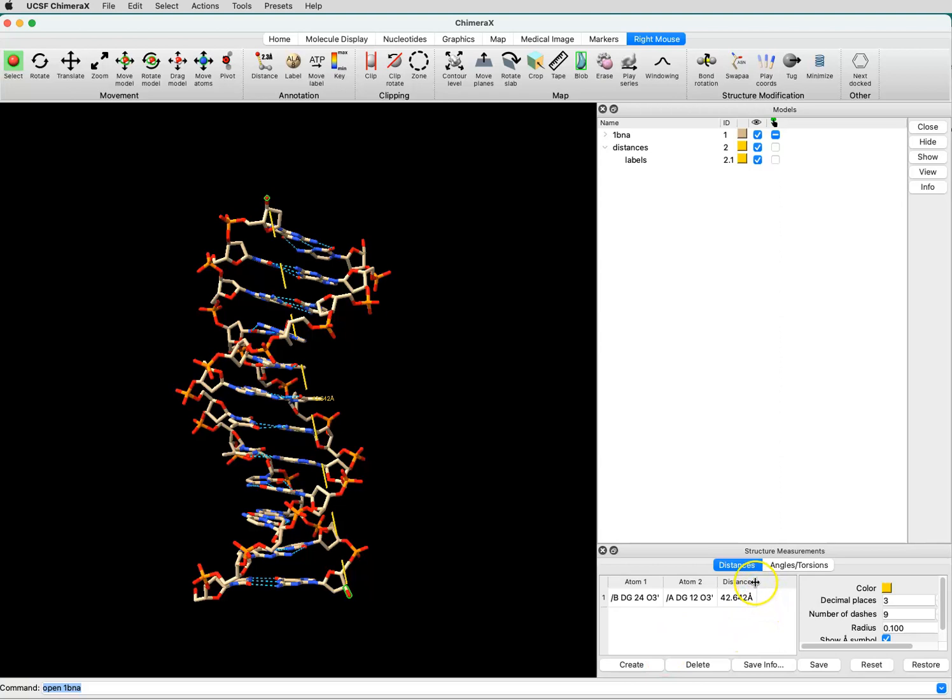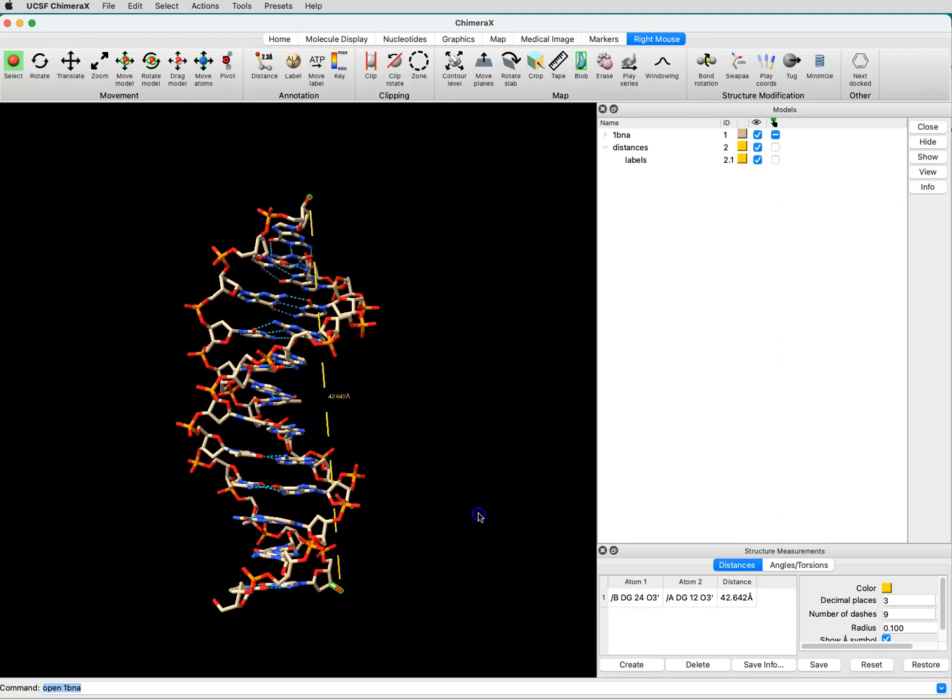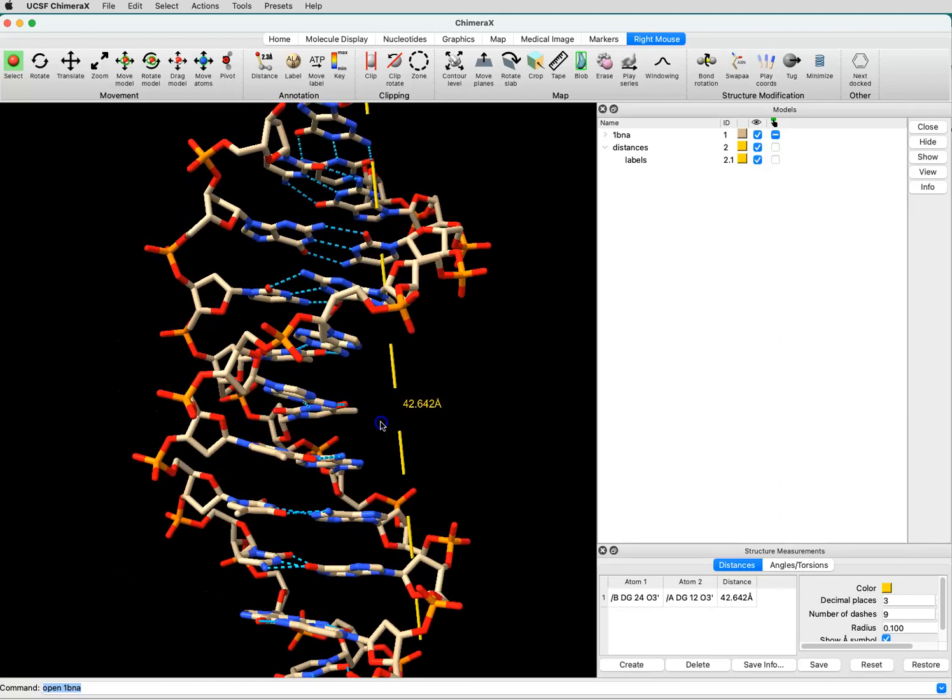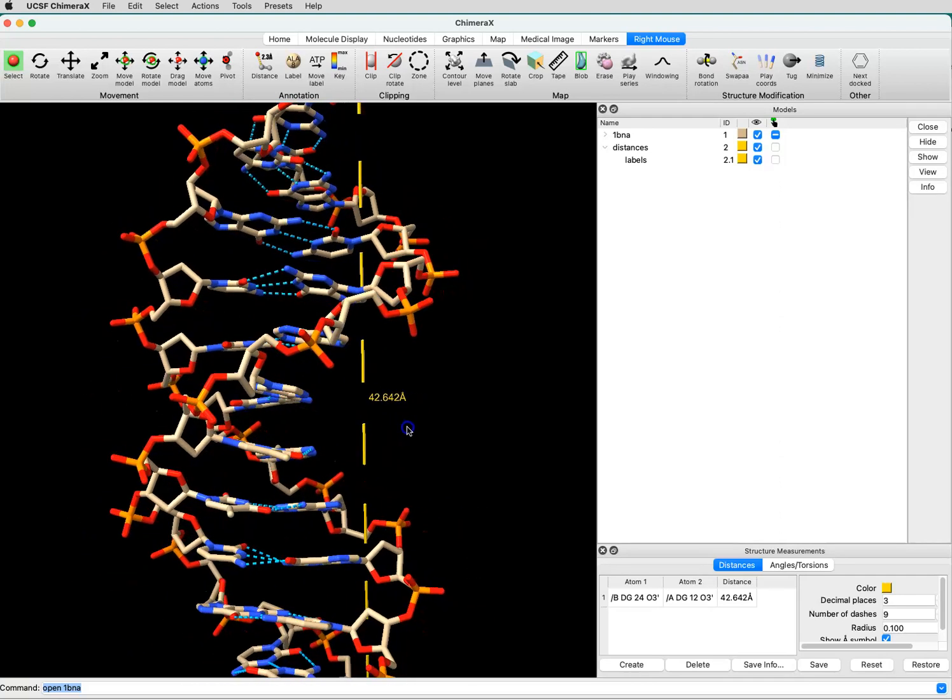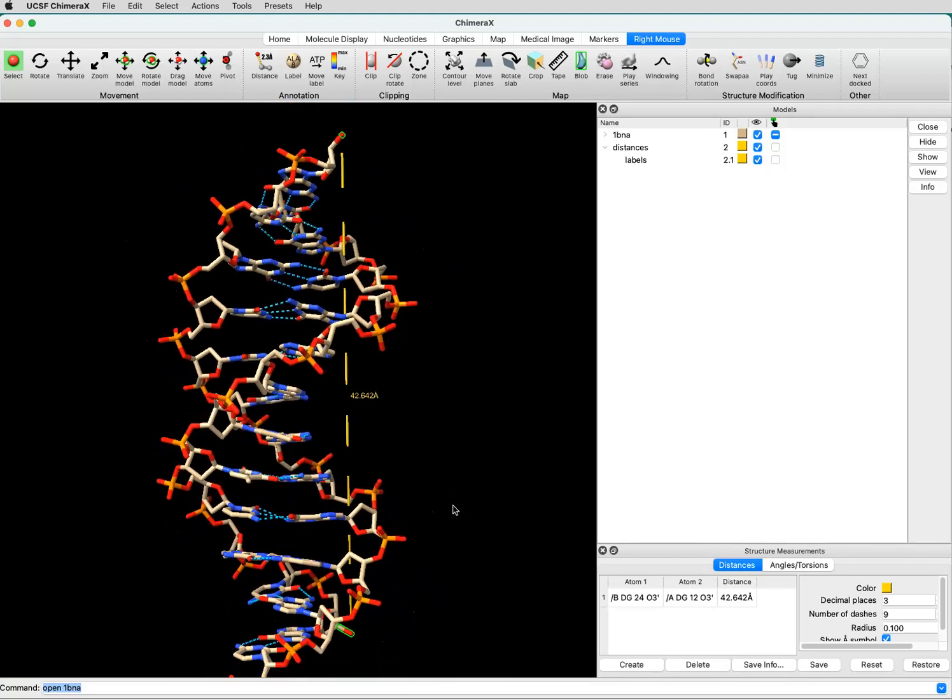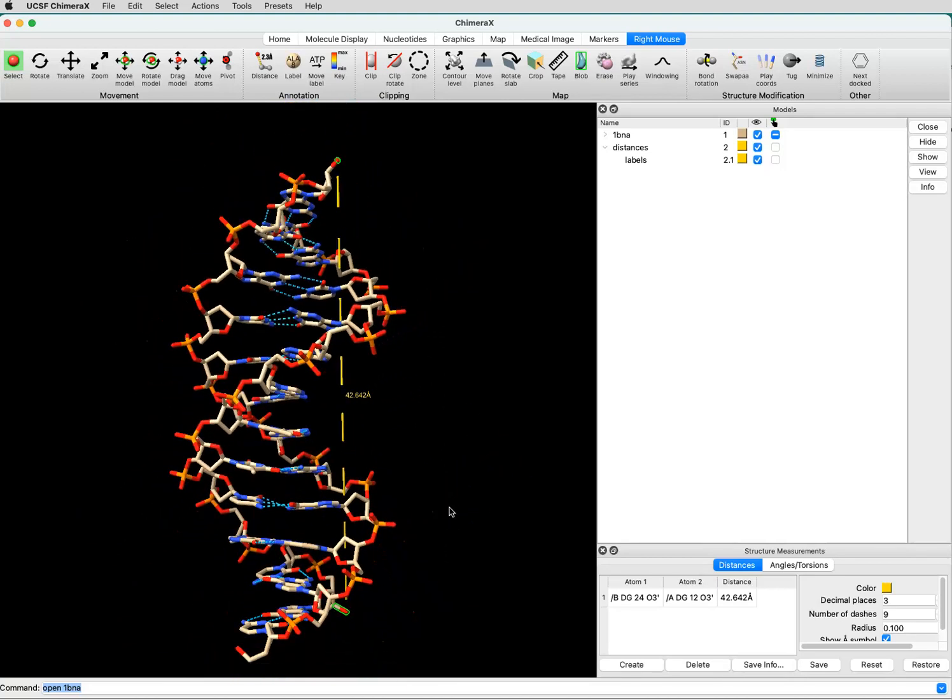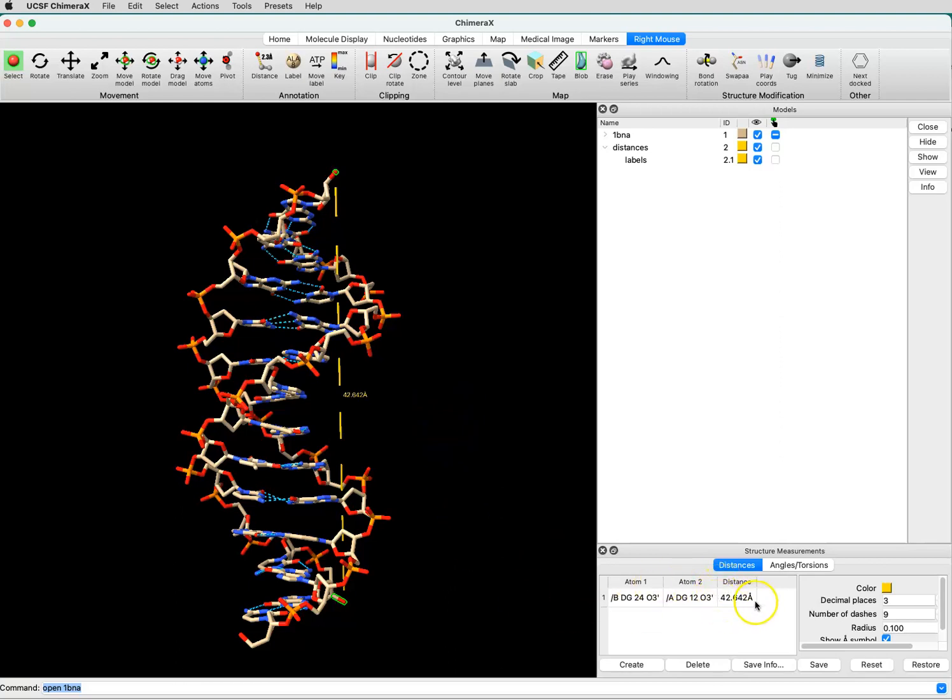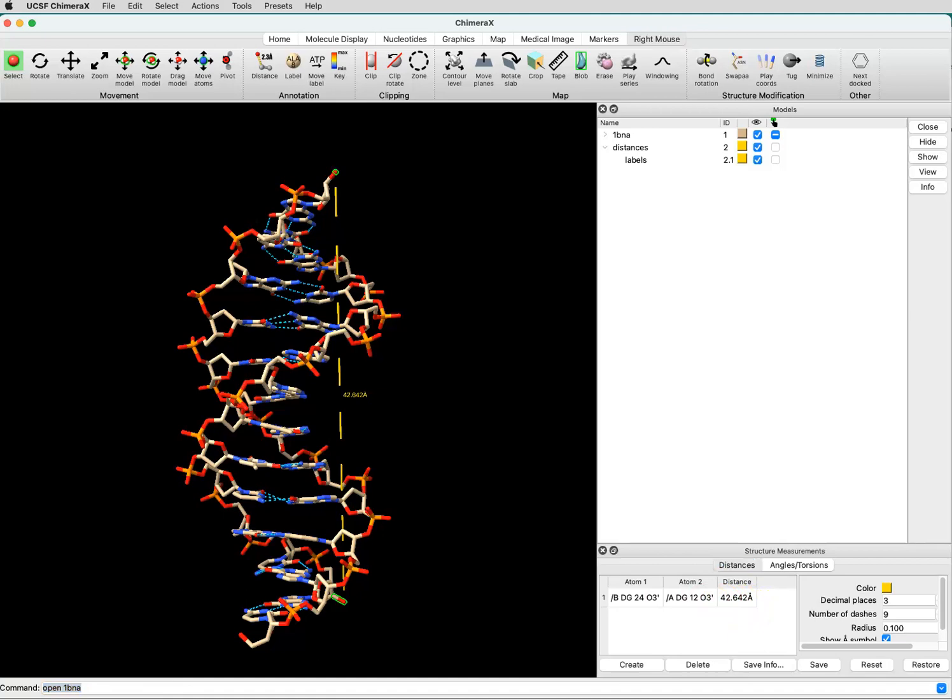The dialog box tells me the distance, but you'll also see that there is a label there. I can zoom in and see it. You can play around with the display of this label if you were making a figure where you wanted to show the distances. I'm just interested in what the distance actually is. So the distance of this helix from top to bottom, or at least from the atoms I measured, is 42.642 angstroms.